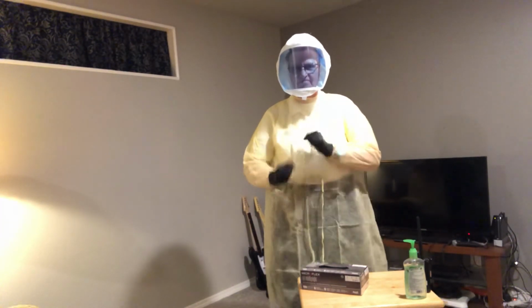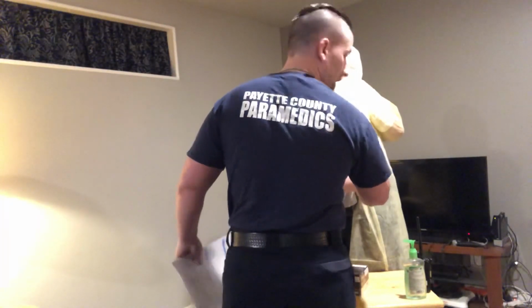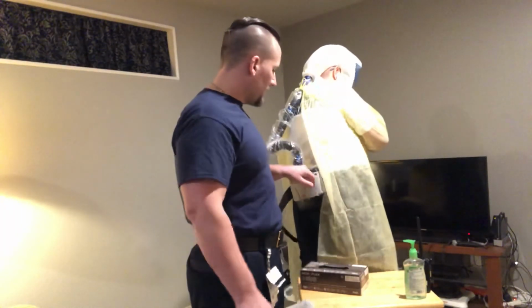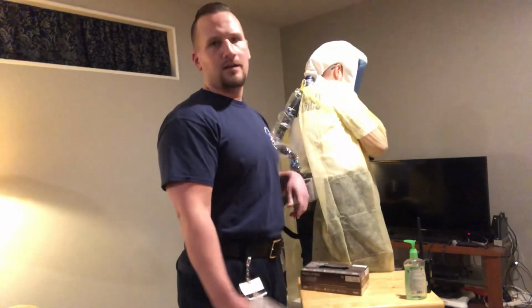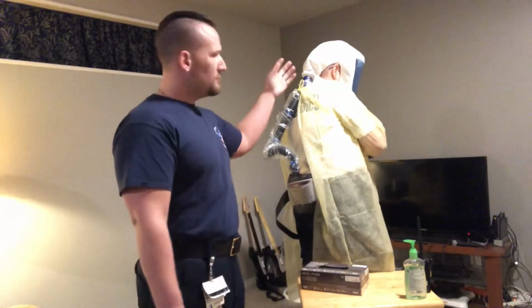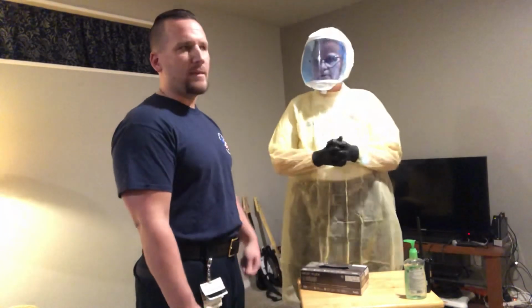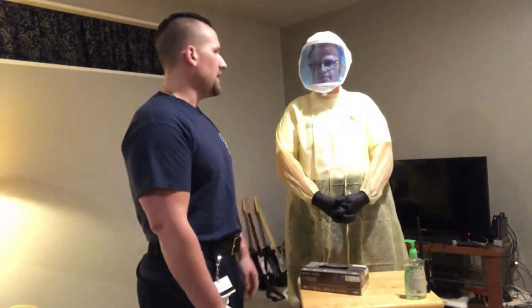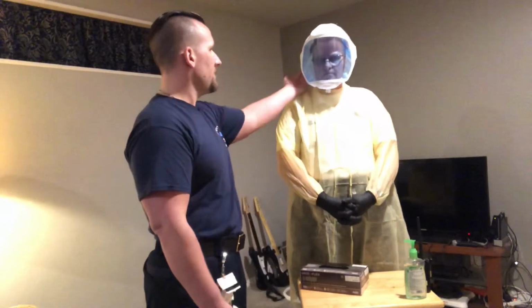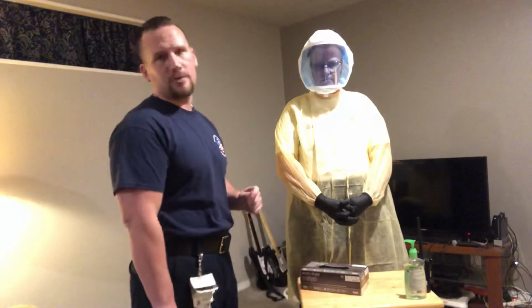Okay, so she's running her PAPR. Now, go ahead and turn around. These indicator lights back here, right? When this is all flowing and good, right? PAPR's running. Jody, do you feel air flowing? Yeah. So basically what it's doing now is it's recycling air, pushing it into the hood, pulling it back out, and then filtering, okay? And it's rather cool. It's cool air, it's not gonna make you sweat. Any worse than you might already sweat if you're me. But anyway, as it pushes air in, it'll pull air out, filter it, keep recycling, and that's how you stay safe. As long as this hood is on, you shouldn't be feeling a bunch of leaks around the outside. If there is, you're not sealed or fitted as well as you could be, okay?